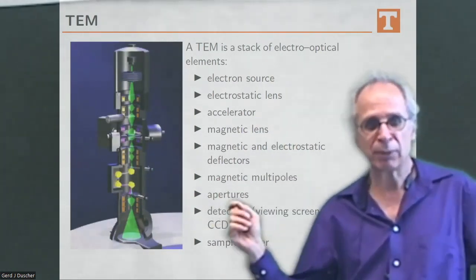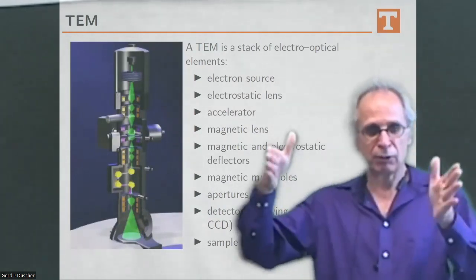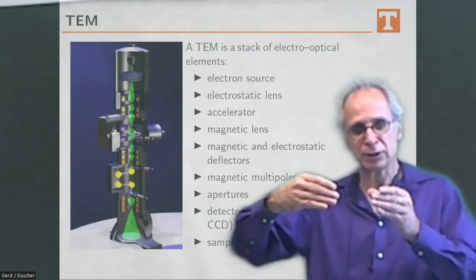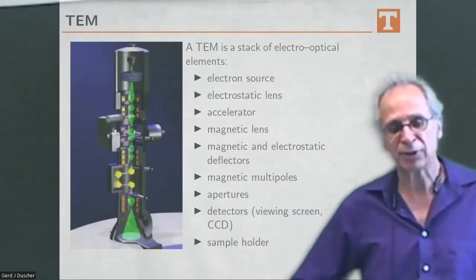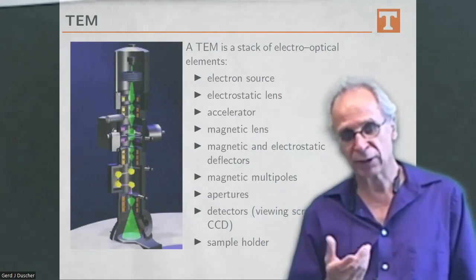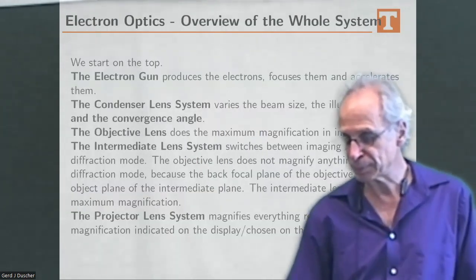Then we have aberration correctors. The simplest one is just a quadrupole. In that case, if you think of a beam and you have, let's say, 2 pluses, 2 minuses, right? The electrons get attracted to the pluses and will be repelled from the minuses. So you can see it gets something like an oval-shaped electron beam at that point, and of course you can make it back. We will talk about aberrations, of course, in the imaging part. That will be the week after next in the Röntgen.